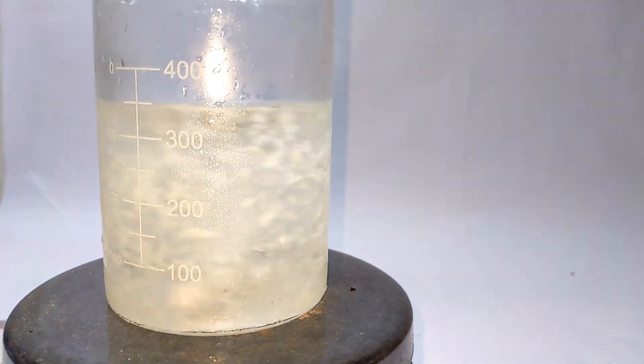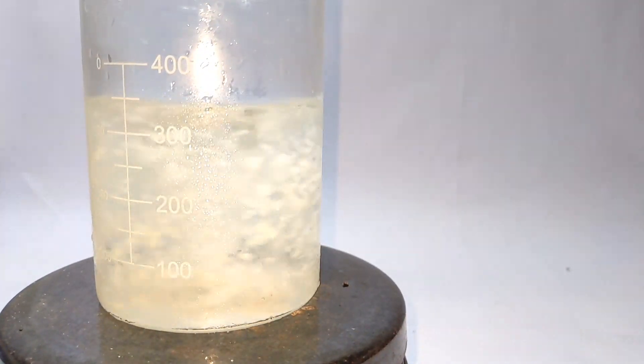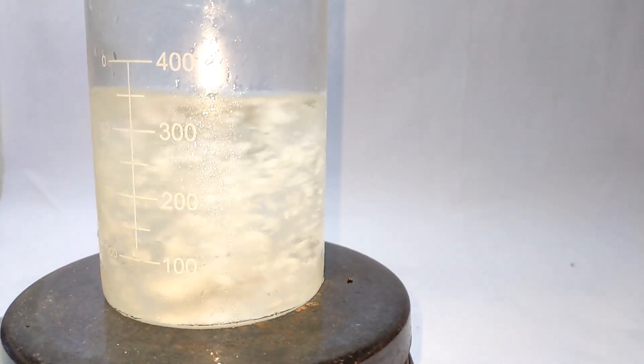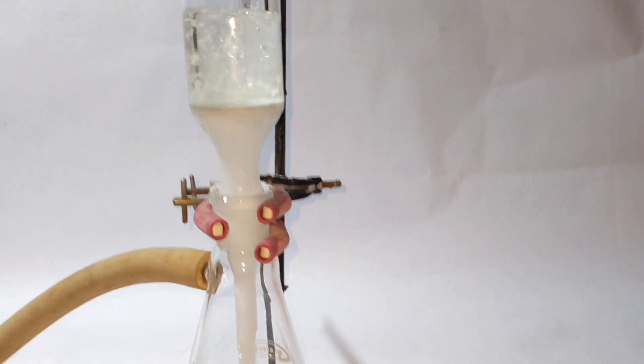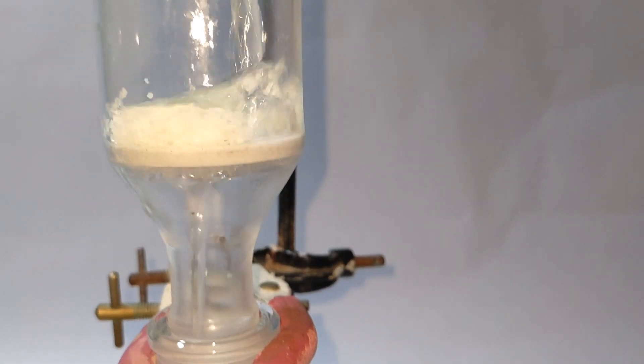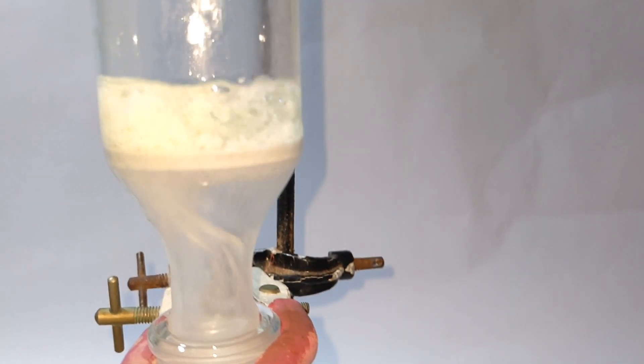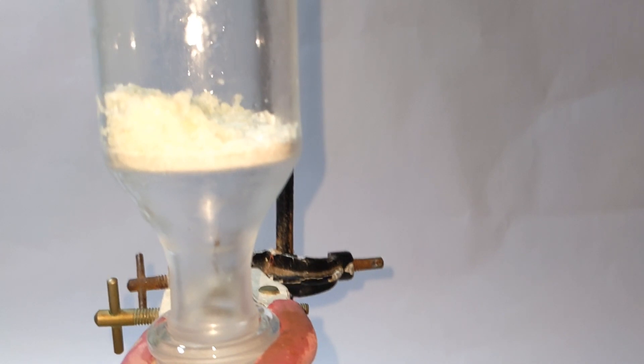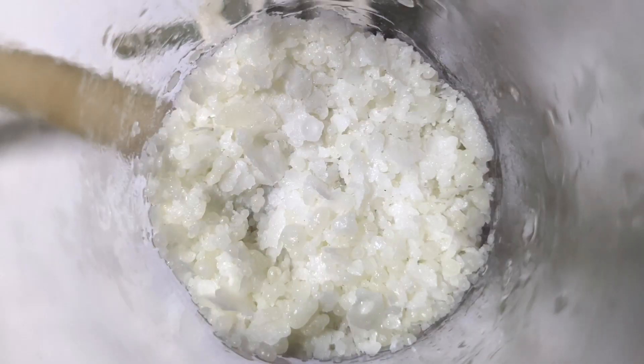This clip just shows the slow motion video of the dinitrochlorobenzene crude product stirring in the ice cold water. It was then vacuum filtered and washed a few times with cold distilled water to remove all the soluble and unreacted reactants and side products. The vacuum was turned on to dry the product. This is the final product 2,4-dinitrochlorobenzene.